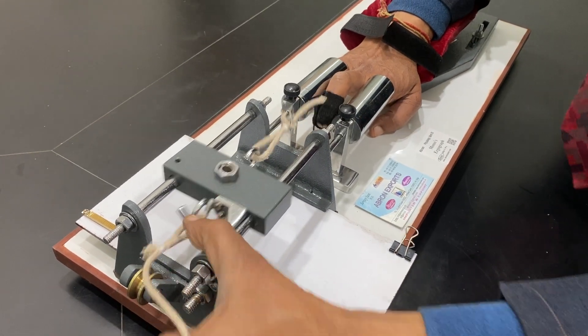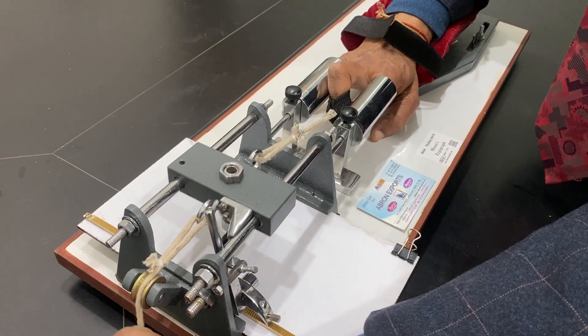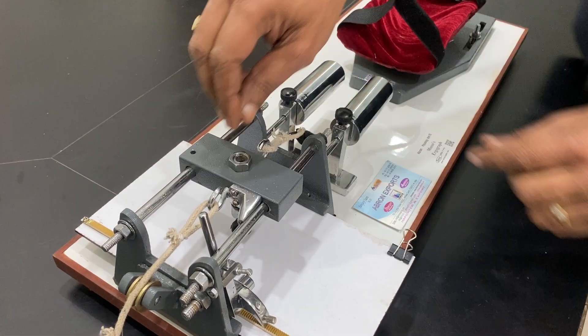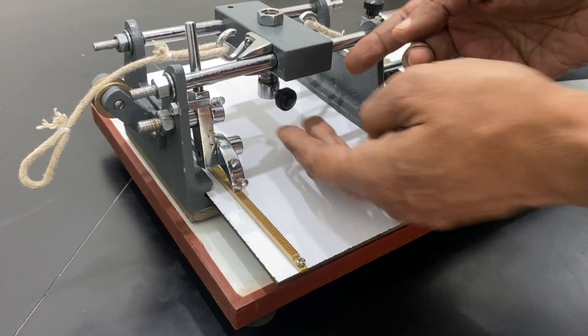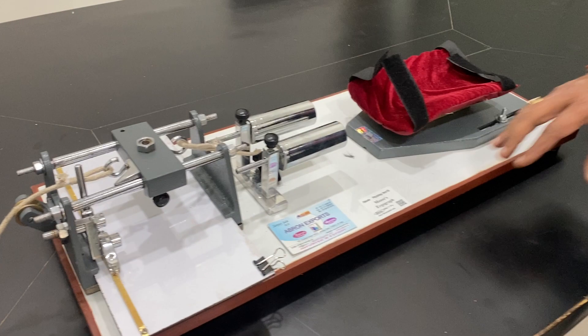With the weight present, it moves only when the weight is there. A paper clip is put and one pen is placed in this pointer so that the graph of the fatigue can be drawn. To see what the graph looks like, please visit the website.